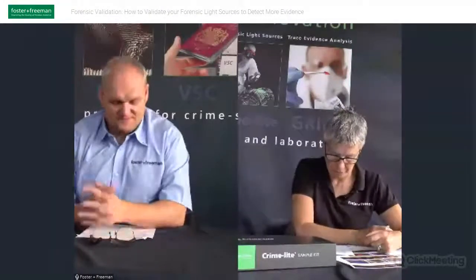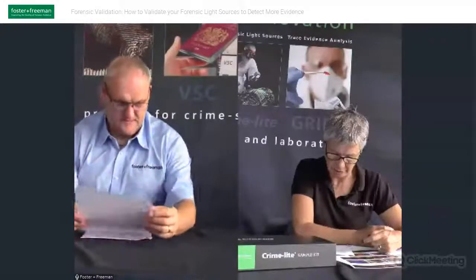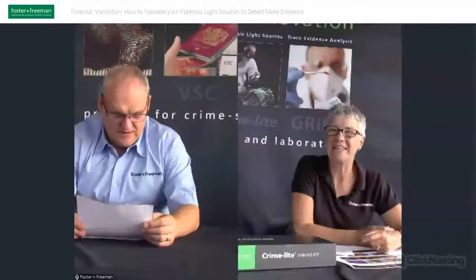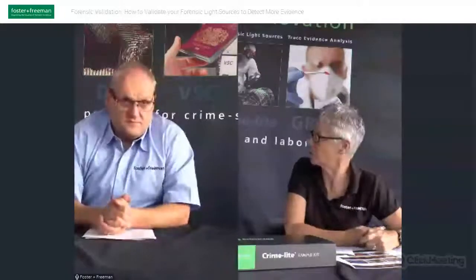And while we're on other pieces of technology, we've been asked if it's helpful in identifying the sequence of strokes of writing and ridges of fingerprint. I think you need the VSC for that capability. So the question came in about the sequence of strokes of writing, and this is a really fascinating application, but the VSC has that technology and capability.